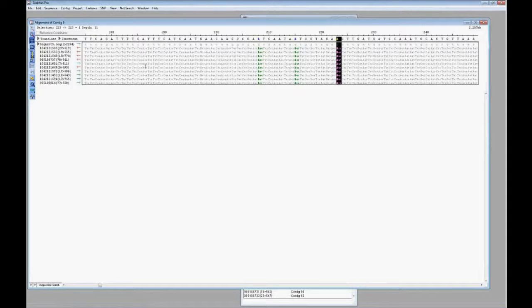Okay, thank you for answering those questions, Katie. And now Katie's going to continue with the third and final part of the live demo, which is on assembly in groups. Great, thanks, Sharon.